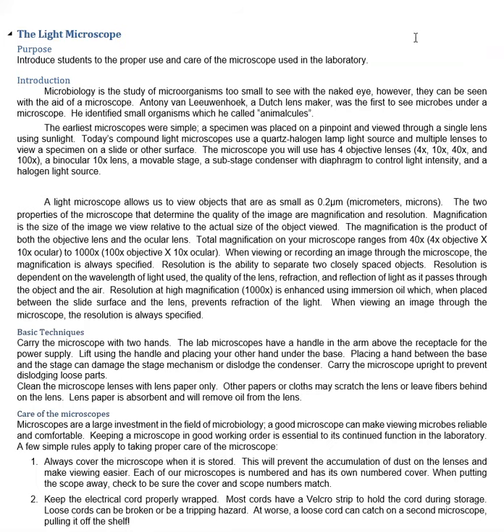Now, we've got two lenses, one in the eyepiece and one in the objective lens. So we multiply those. The lens that we put our eye on is going to magnify 10 times. The lenses on the bottom, the objectives, will either magnify 4, 10, 40, or 100. So let's say the lowest one, 4. If I use a 4x objective and the 10x on the eyepiece, that's 10 times 4 is 40. That's kind of what we got.